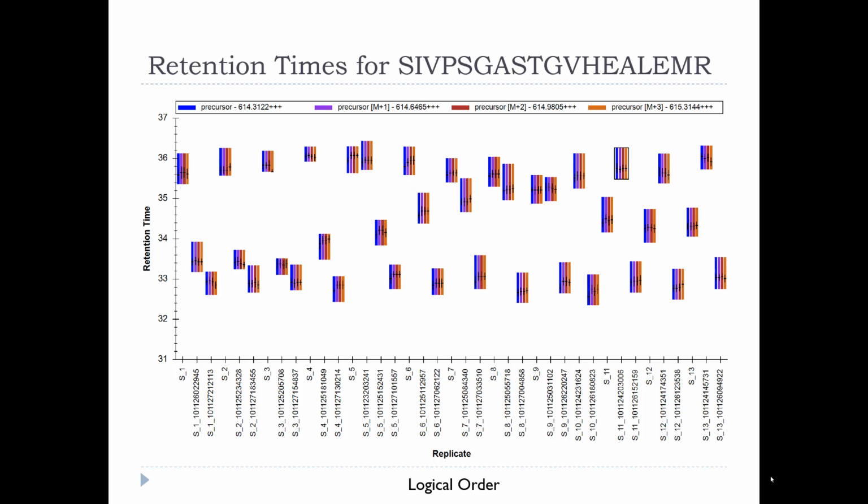And what do you think when you see this? Does this look like I probably have the same, or what do you see? Have you been looking at some of the data? Does this look similar to the data you've been looking at in Skyline for retention time? So what's the problem? What would you like to see? What do you expect to see? Yes, you'd like to see a straight line, yeah. And so is this just normal variance, do you think?